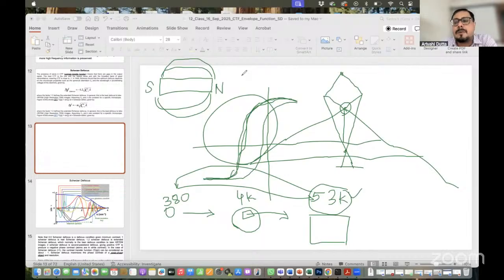Also, if you try to process the data, you can see that the signal is significantly affected or the CTF is affected. From those things, you can tell that the images are affected, but it cannot tell you particularly whether it is coming from drift, or from lens hysteresis, or from some environmental issues. It will be very difficult to tell from the image what it is particularly coming from.